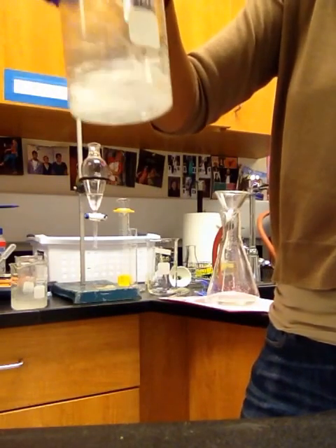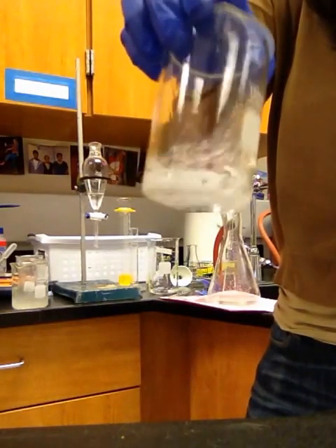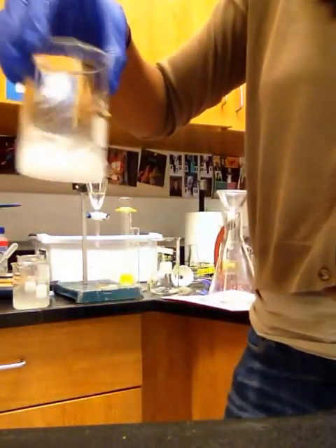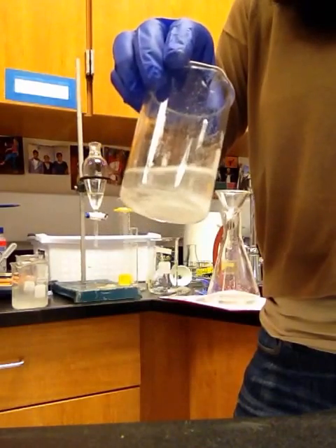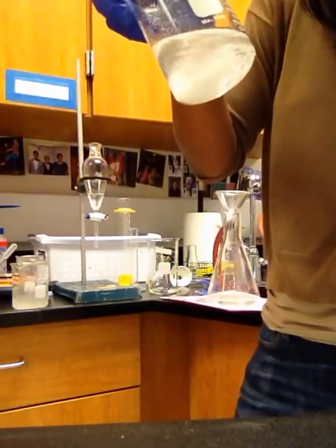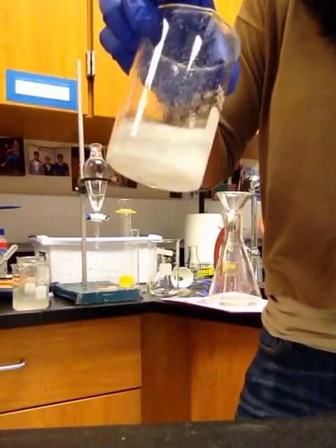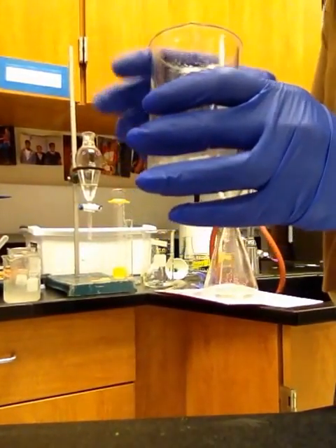That means there is water in it. We are going to keep adding MgSO4 till it does not clump anymore. And now you can see that MgSO4 is moving freely and not clumping. So at this point we know we have dried our organic solvent.